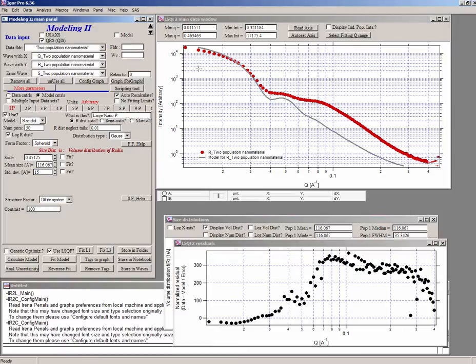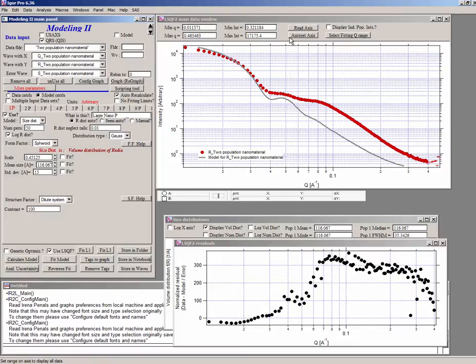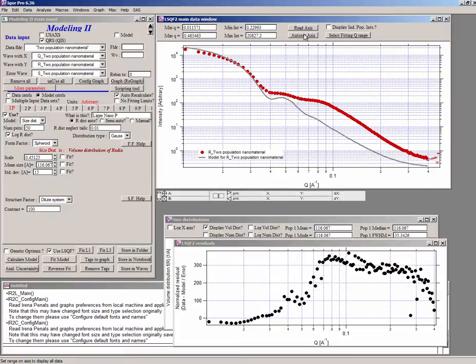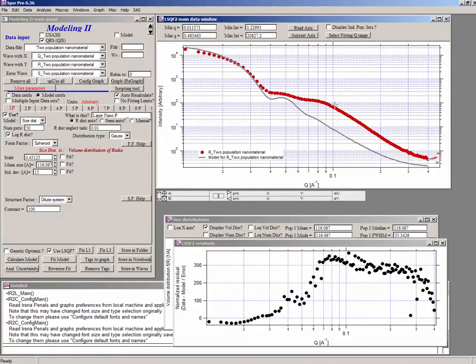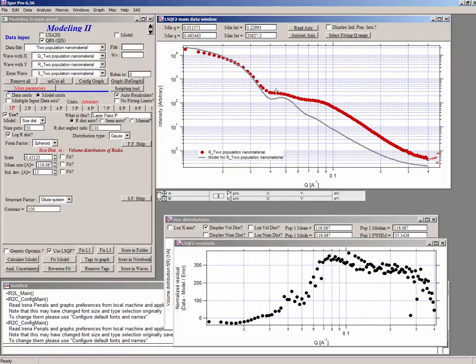So now I'm getting closer. But this is too narrow. So I can change this to maybe 15. Okay, that's better. So now what we have is we have the data are reasonably well, you know, closer fitted here than anywhere else. If you want to reset this graph, you can hit auto set axes. And then if you want this graph not to change as you are working on it, you can freeze the axes. That's going to make sure that the graph scaling doesn't change all the time. So this is coming closer. And then we have the second oscillation.